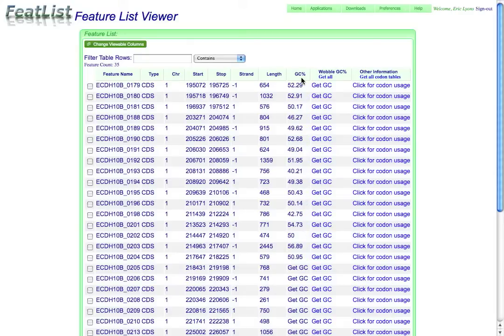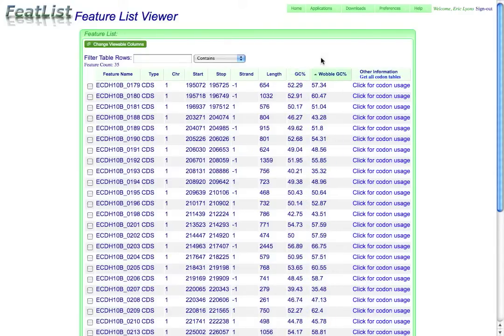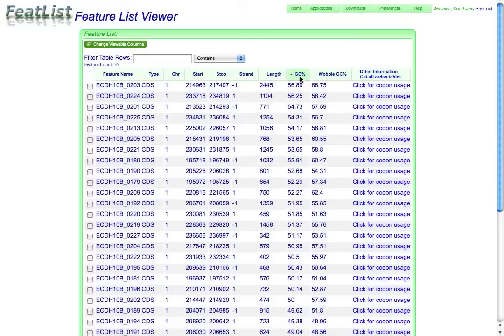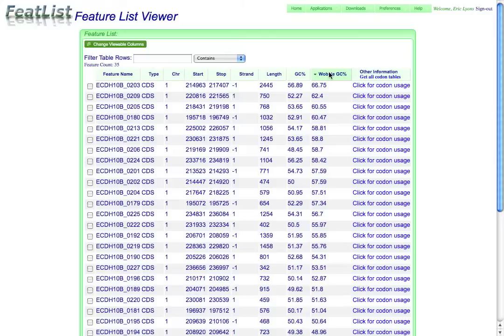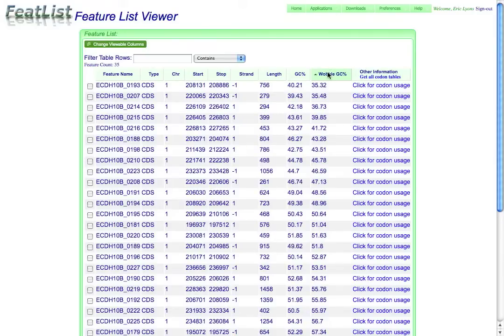So here I have a way to get additional information. If I want to get it, I can click the individual things I'm interested in, or just the get all list, and this will go through and calculate the GC content. So I can see that I have an overall GC content that varies from about 57% down to about 40%, and a wobble GC content that starts at about 67% and decreases down to 35%.